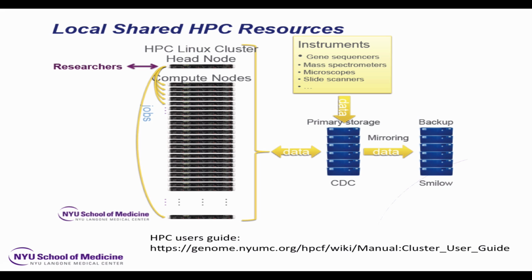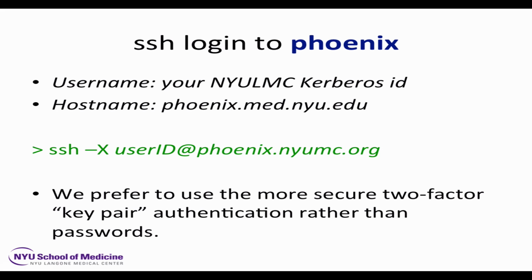As we recall, when we log in, we're going to use the head node, but this is not a job you can run on the head node. You have to write your command into an SGE script and then submit it to the worker nodes via the qsub command. Okay, and here's your user's guide if you don't remember all the details on how to write your qsub scripts, but I'm going to review it today.